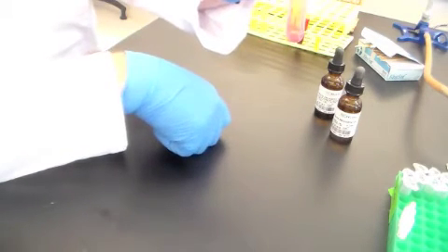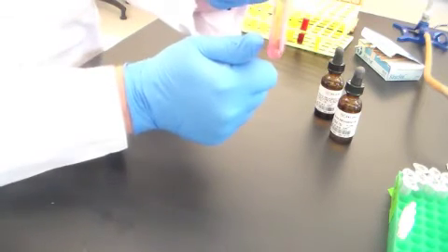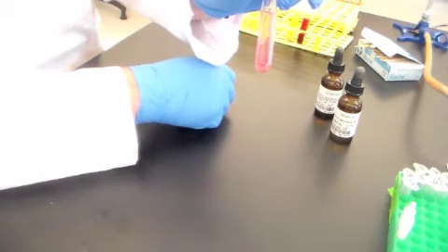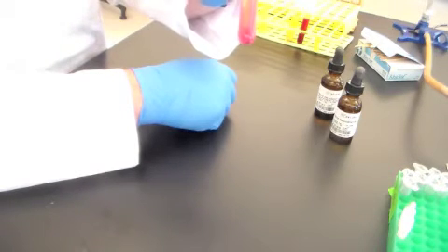That red color now indicates that this bacterium, I know there's no bacterium in here, this is my uninoculated control, let's pretend there were bacteria growing in here. What this red color means after the addition of zinc is that this was a true negative. If you did not get a color here with the zinc, that would mean that the bacteria in that culture had reduced nitrate beyond nitrite to something such as ammonia or nitrogen gas, something that this test will not determine.